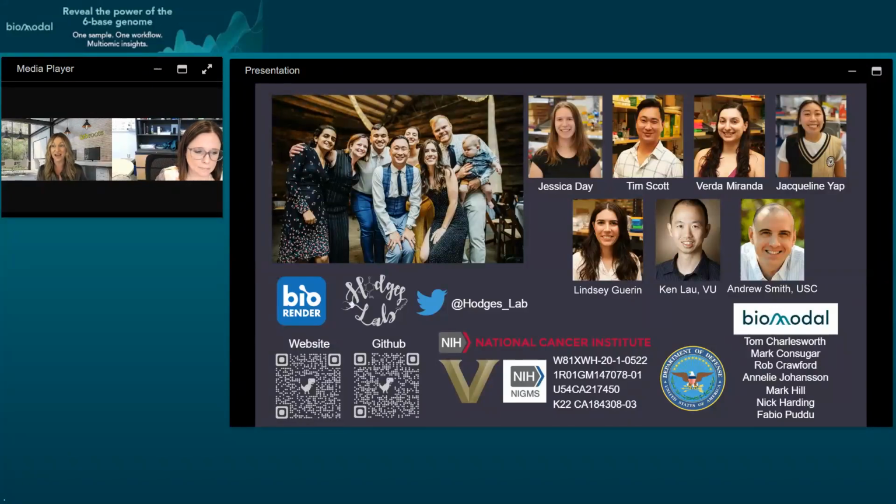Very good. Hi, very nice talk. Maybe I have missed it, but is it possible to directly couple 6-base sequencing with ATAC-STARR-seq, similar to ATAC-me? Thank you. This is a great question. Yes, I would love to be able to do that.